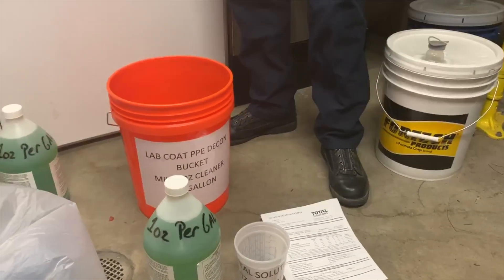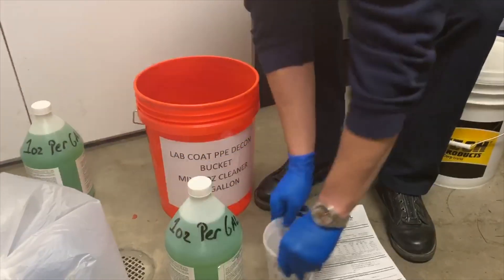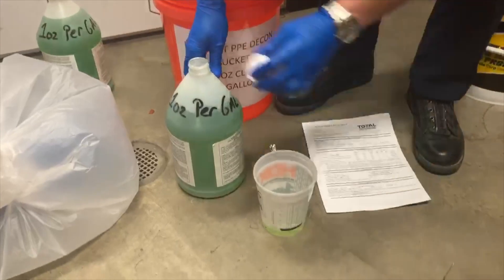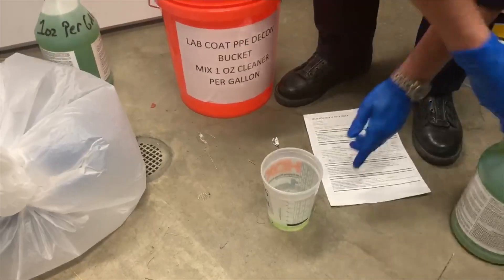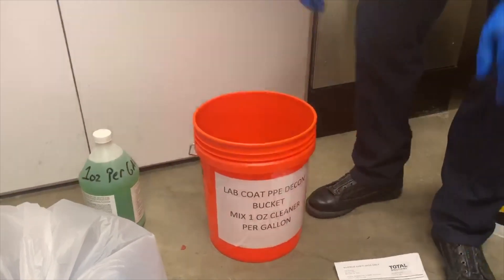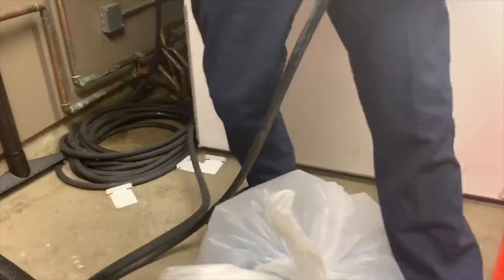We'll get back to the station and mix up the solution at one ounce per gallon — approximately four ounces of the cleaner in the bucket. We'll fill the bucket up and then put the coat in. So Justin is going to mix four ounces of solution, put it in the bucket, and then mix this with hot water, which each station should have accessible via a hot water spigot in their decon room.